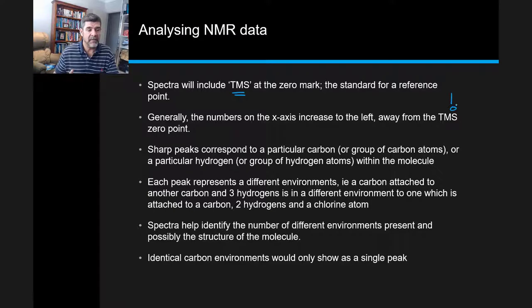Every different peak represents a different environment. For carbon, that's easy because it tells us how many different types of carbons there are at an absolute minimum. Two peaks means a minimum of two carbons and potentially more.